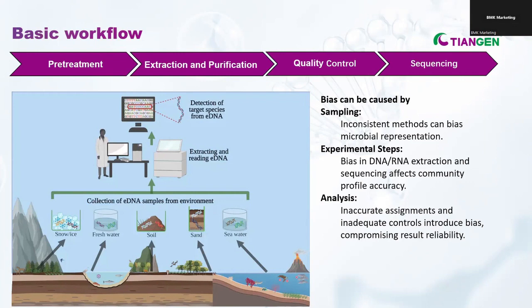Scientists can either read all of the DNA present from every organism or target just the DNA from species of interest. Nowadays, even though defined protocols exist, more and more kits are designed especially for microbiome research. There are still lots of difficulties in this field, like the researcher needs to consider barriers from DNA recovery to PCR. For example, the humic acid from soil and bile salts from feces are all inhibitors and will affect the downstream application. And another feature is that bias sometimes makes the result confusing.